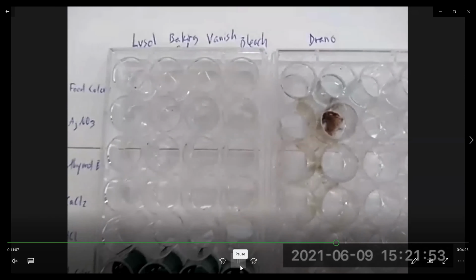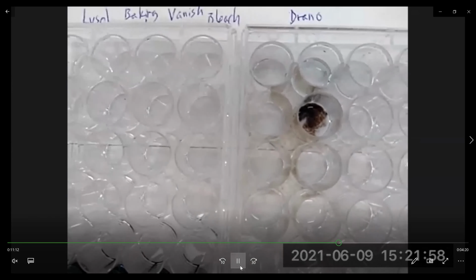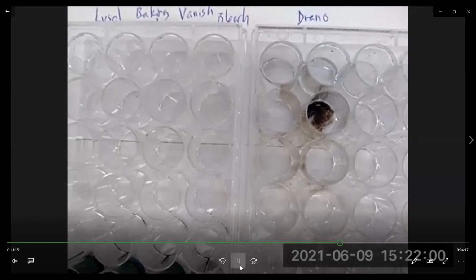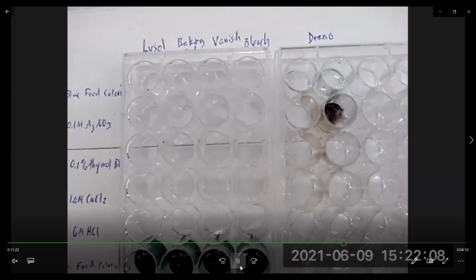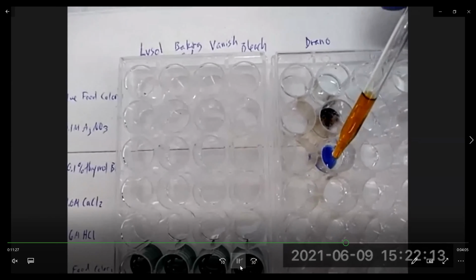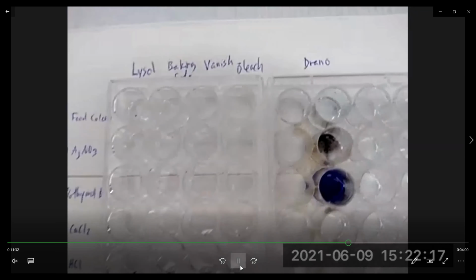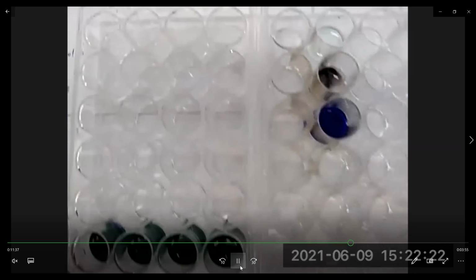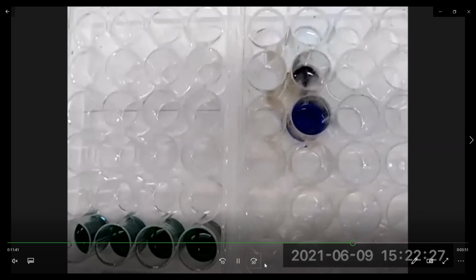Next, we're going to add the Thymol Blue, which is an acid-base indicator. When it's in an acidic solution, it's one color. If it's in a basic solution, it has a different color. So you should look up the acid-base indicator Thymol Blue to see what color it is in an acidic and basic solution. Here, when we add a few drops of Thymol Blue, since the key ingredient in Drano is sodium hydroxide, very basic, it turns a blue color. Again, disregard what you see in the lower left-hand side.